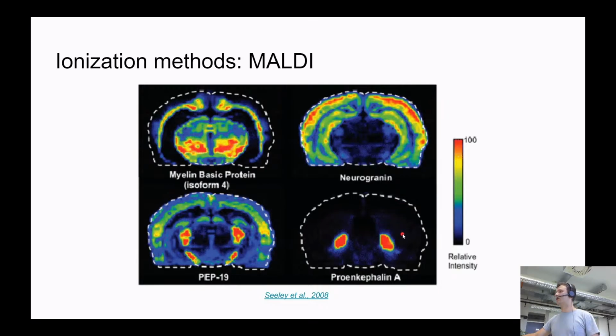In this sense, it's a very powerful method. It can be brain, it can be any tissue, it can be cancer, it can also be plant. It works well. Okay, cool.